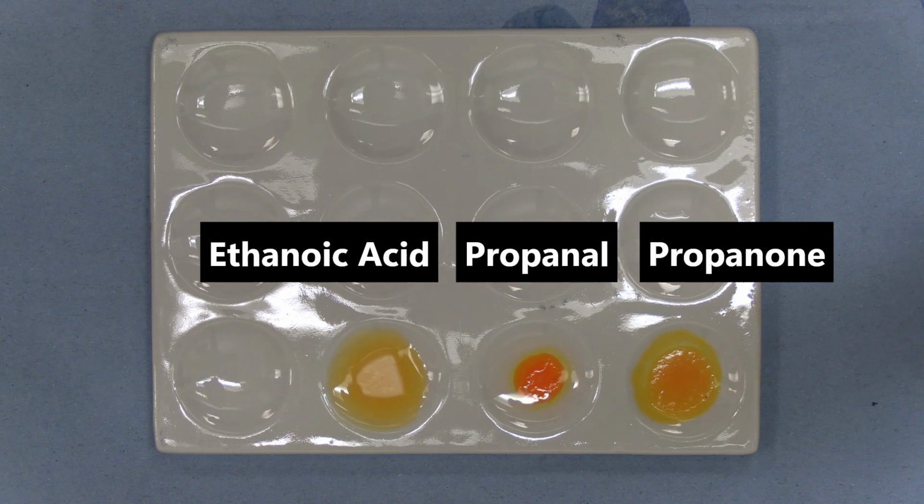This experiment can be followed up by determining the melting point of the precipitate for more confirmation.